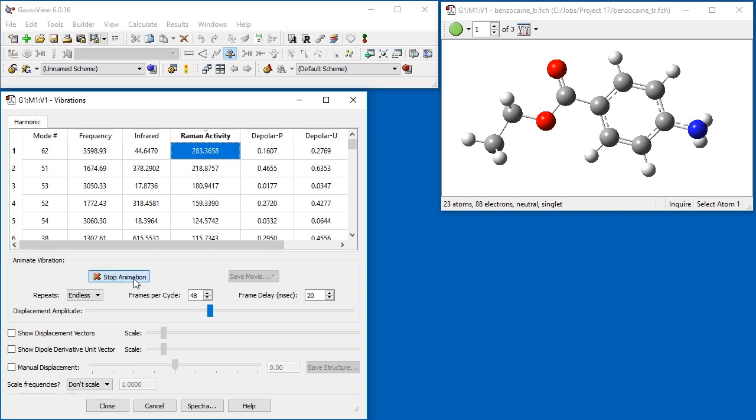We can animate them as usual. Here we use the Displacement Amplitude slider to decrease the range of motion.